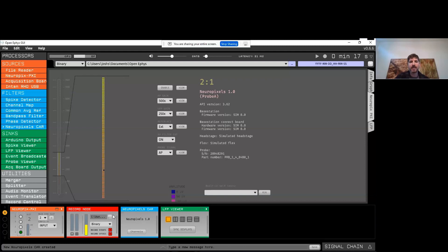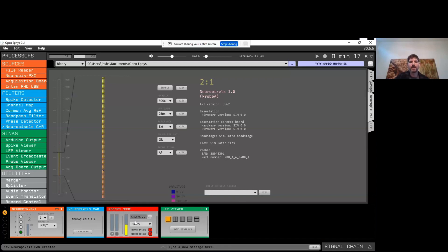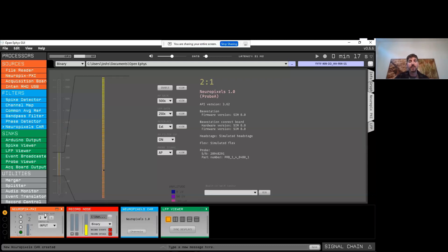I dropped this into the signal chain to the right of the record node, but if I dropped it to the left of the record node, the behavior would be slightly different. Signals always flow from left to right in the signal chain. So if the common average reference is placed here, it means the data being recorded by the record node will have this referencing applied. Usually we recommend recording data exactly as it comes out of your acquisition system, and then using filter plugins for visualization purposes.